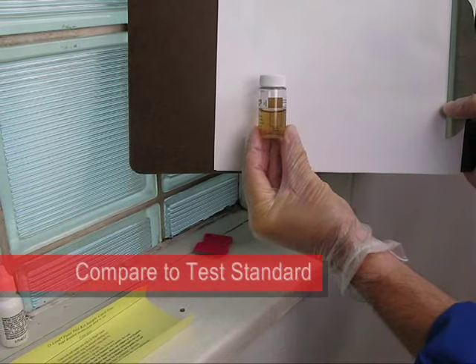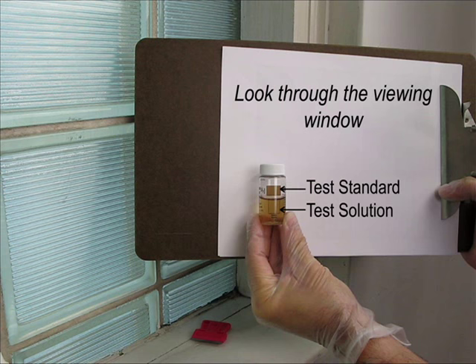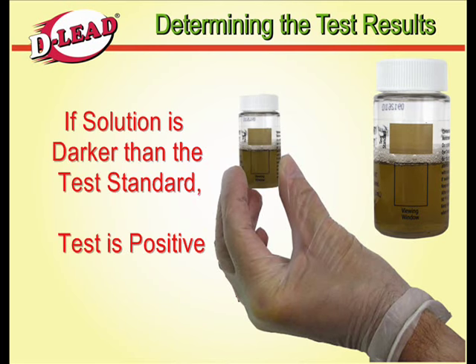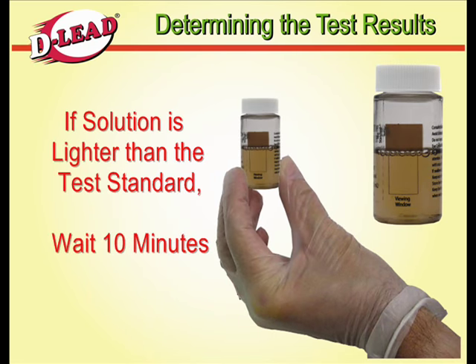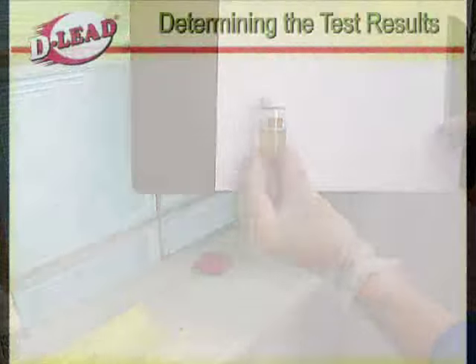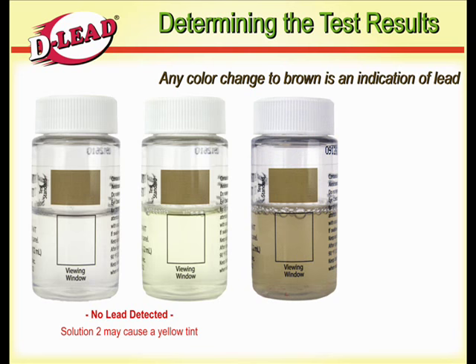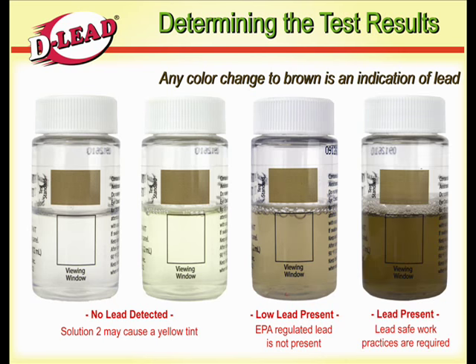To check if EPA-regulated lead-based paint is not present, hold the bottle up to a white background and look through the viewing window, comparing the test solution to the test standard printed on the bottle. If the test solution is darker than the test standard, the test is positive and lead safe work practices are required. If the test solution is lighter than the test standard, wait 10 minutes, then shake the bottle and compare to the test standard again. If the solution is clear, no lead was detected. The addition of Solution 2 may cause the solution to have a yellow tint, but this is not an indication of lead present. Any color change to brown is an indication of lead. If the test solution is lighter than the test standard, EPA-regulated lead is not present. If the test solution is darker or the same color as the test standard, lead safe work practices are required.